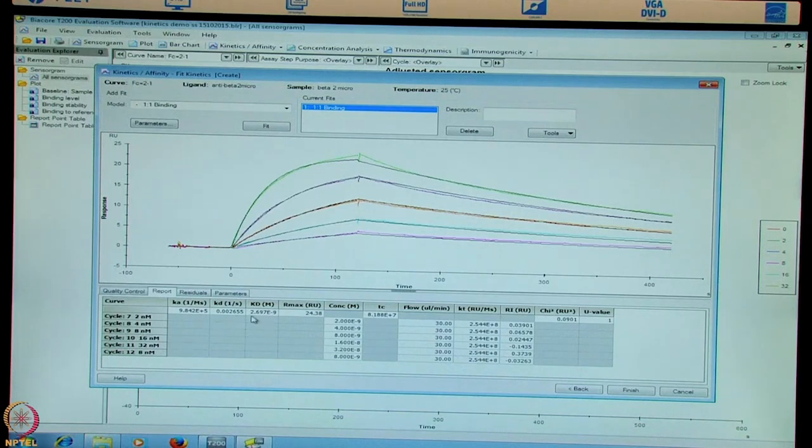So KD refers to the affinity of the two molecules, which is 2.6 × 10^-9 molar or 2.69 nanomolar affinity. Rmax or maximum number of binding sites available at 24. Chi-square of 0.0901 should be below 1 at least. U value below 25 is always considered to be good.